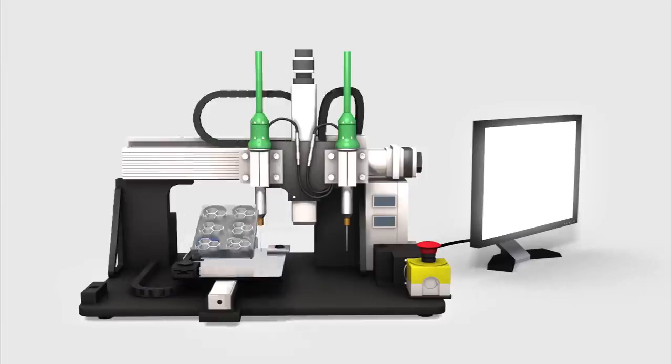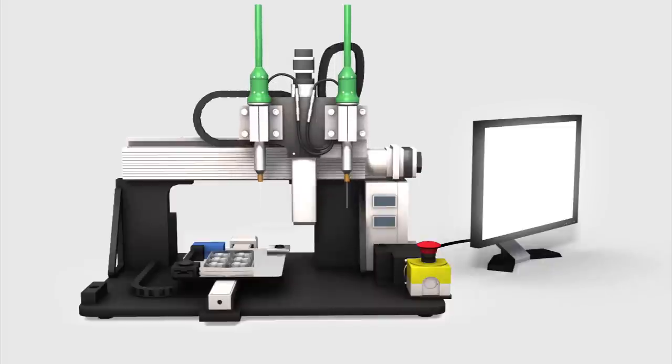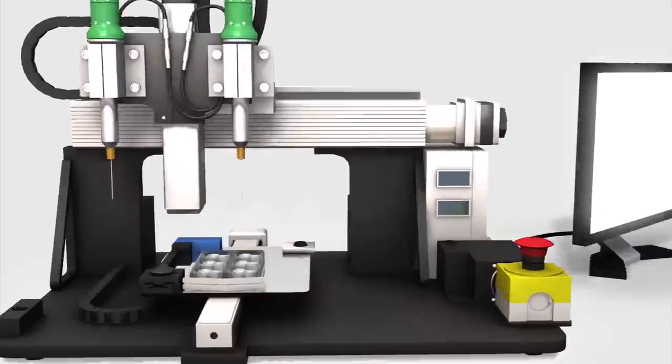A computer connected to the printer instructs a robotic arm that moves the syringe to print a mold in a honeycomb pattern.